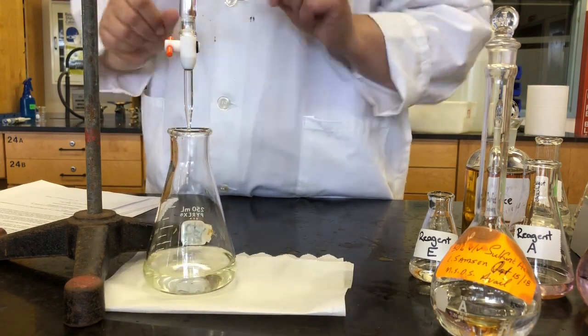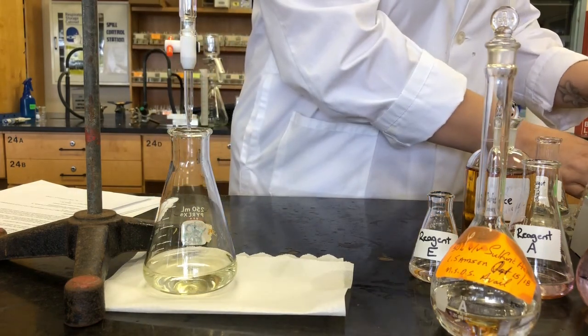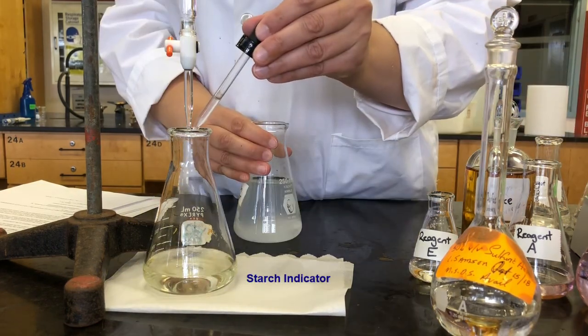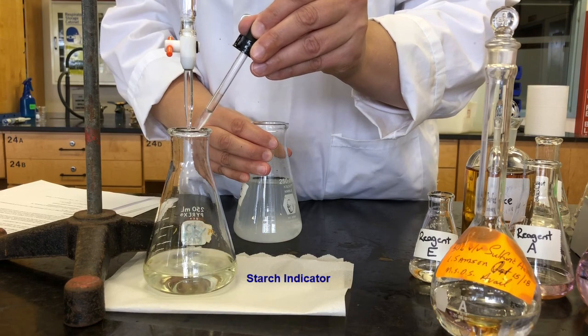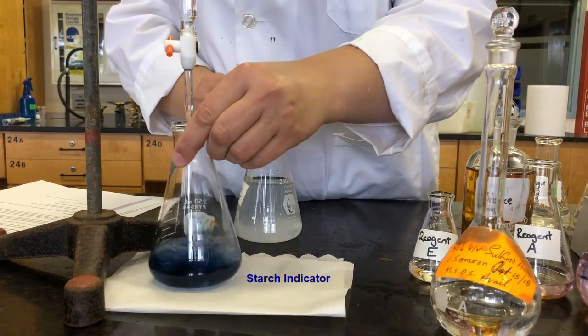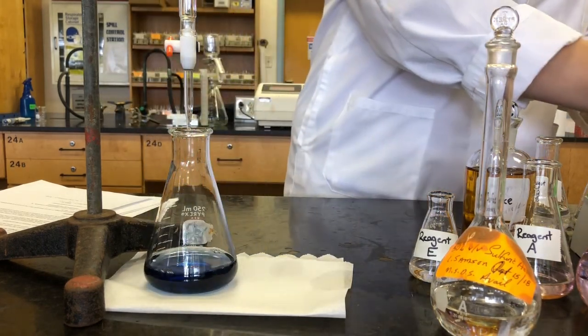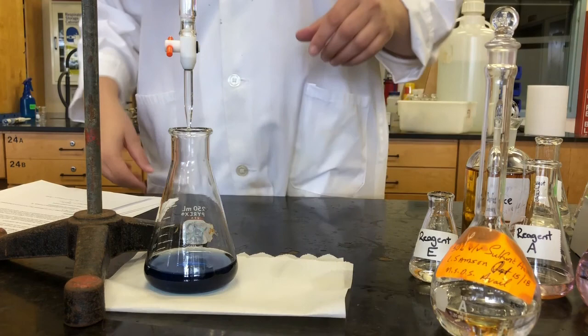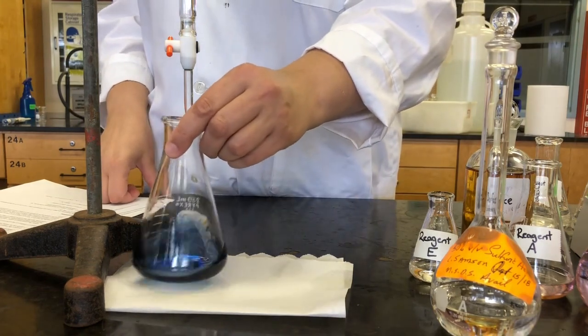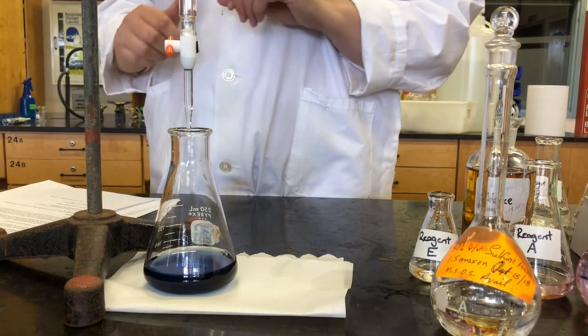Okay, so that's our pale yellow. So at this point, we're going to add our starch indicator. A few drops of starch. And we're expecting it to turn blue. There we go. So now that we've added the starch solution, we're going to continue our titration.